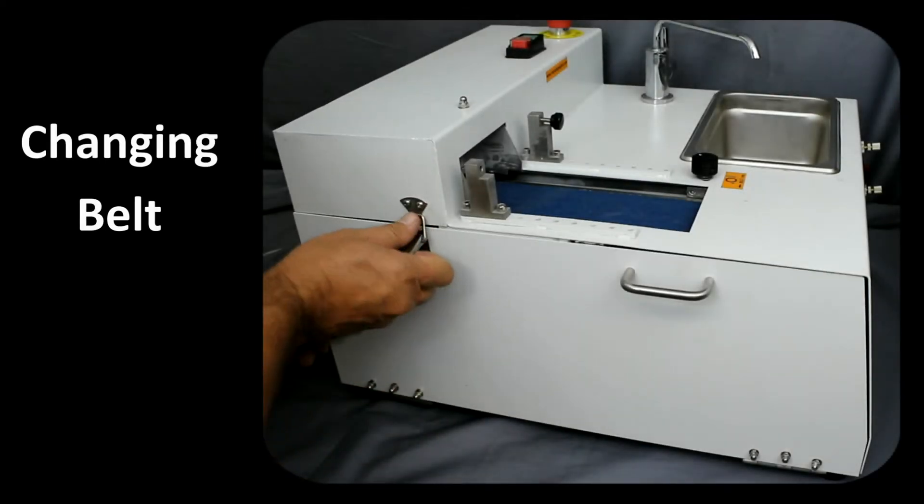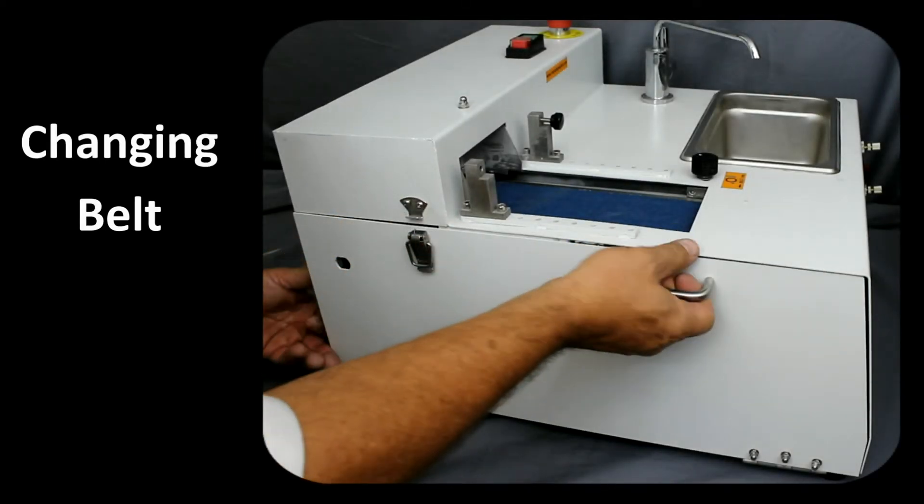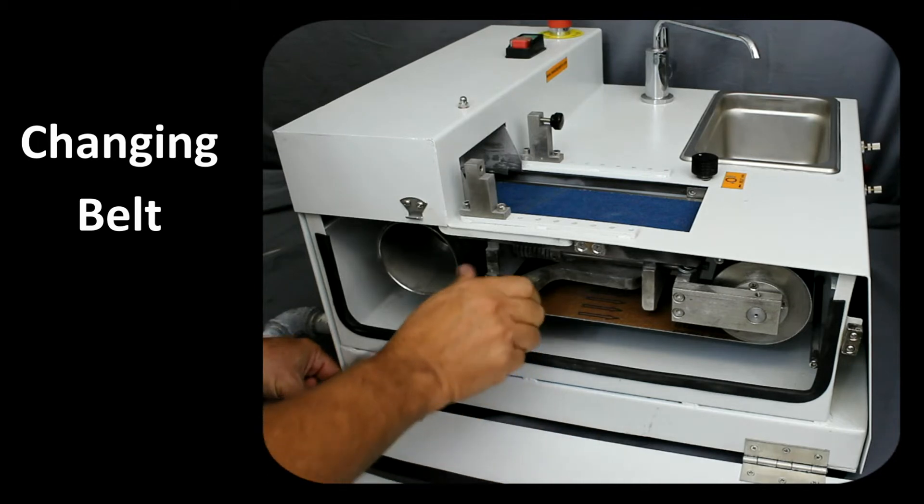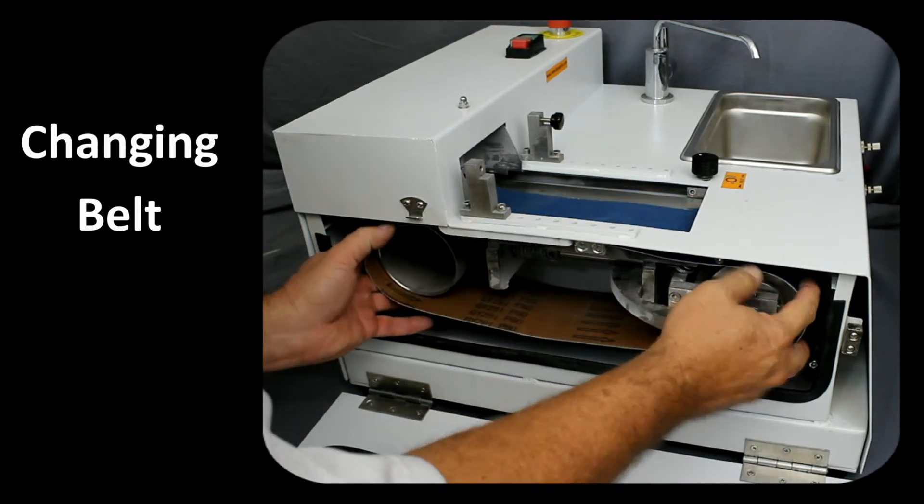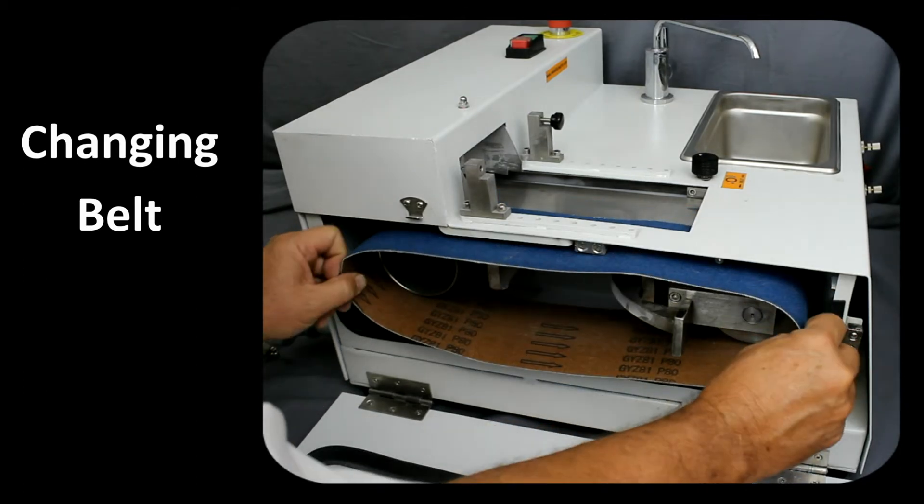Changing the Penta 7500 abrasive belt is very simple. Open the side panel and pull on the belt release lever. Remove the old belt and replace with a new belt.